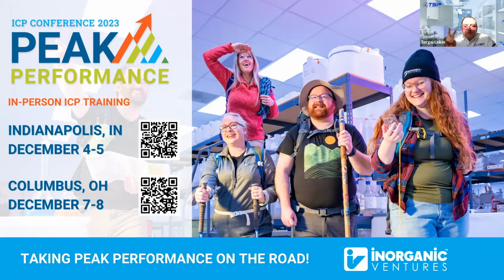So there are 2 different types of cyclonic spray chambers. If we're talking cyclonic, there is baffled, which has a tube inside the spray chamber, and non-baffled. By design, if you put one versus the other, you get a 20% difference in the signal, right? So non-baffled will give you a higher signal than the baffled. Baffled is going to filter large particles, and is usually recommended for inorganics, and my preference is to use a baffled spray chamber because you get a finer mist and you get better RSDs in general. So the detection limit gain for baffled versus non-baffled is debatable, because you may have a high RSD with high signal and the detection limit is going to stay the same, but it's a question of preference.